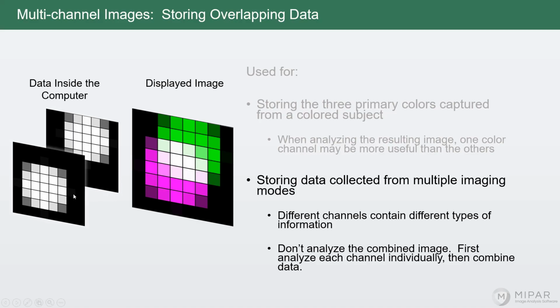So it's more accurate to find the location of each signal independently in its own channel, and then take that processed data and perform co-localization analysis on that. So you'd circle this and you'd circle this and find where those two circles overlapped in between them.